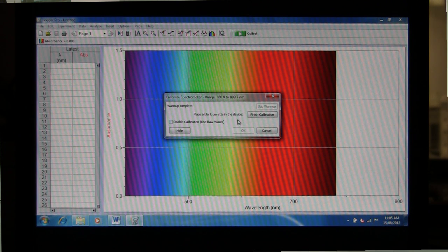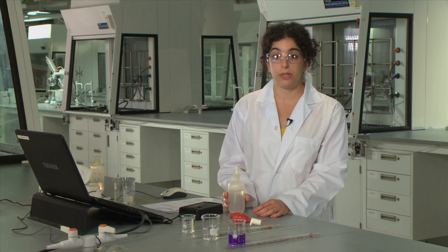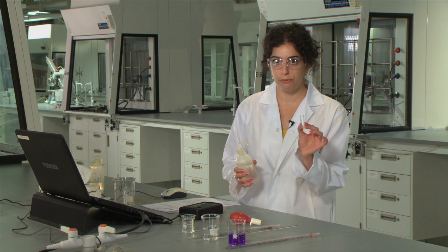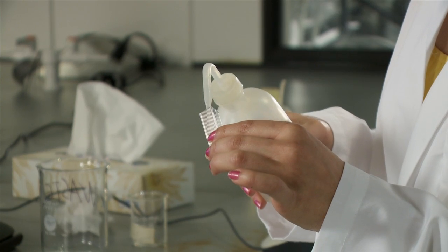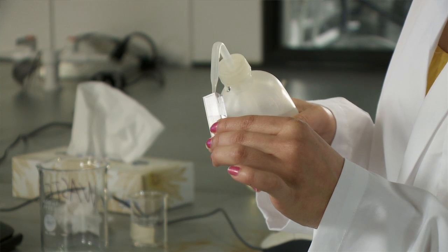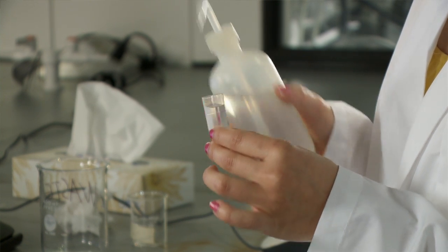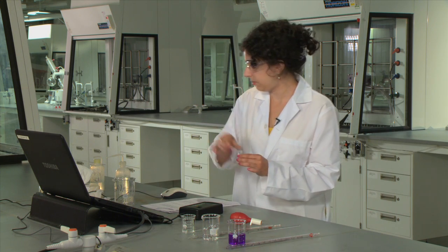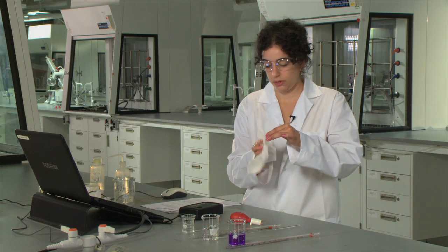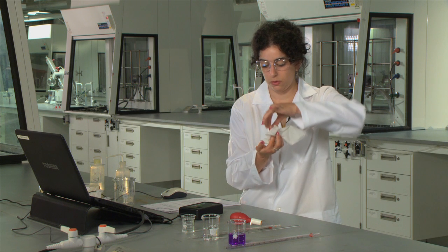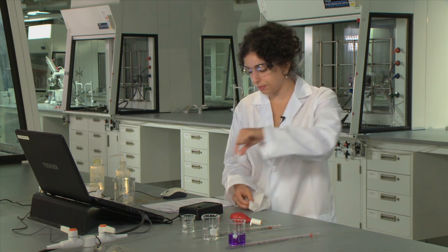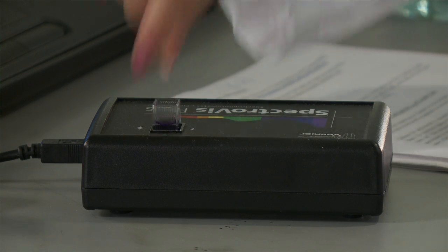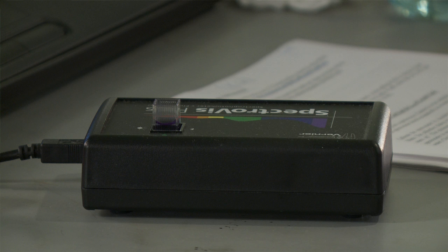We're then going to place our blank in our sample. The blank for this experiment is going to be distilled water. So you will fill up your cuvette about three quarters of the way using your distilled water wash bottle, give it a quick wipe, and place the cuvette inside the spectrometer so that the clear side of the cuvette is facing the detector and the lamp.